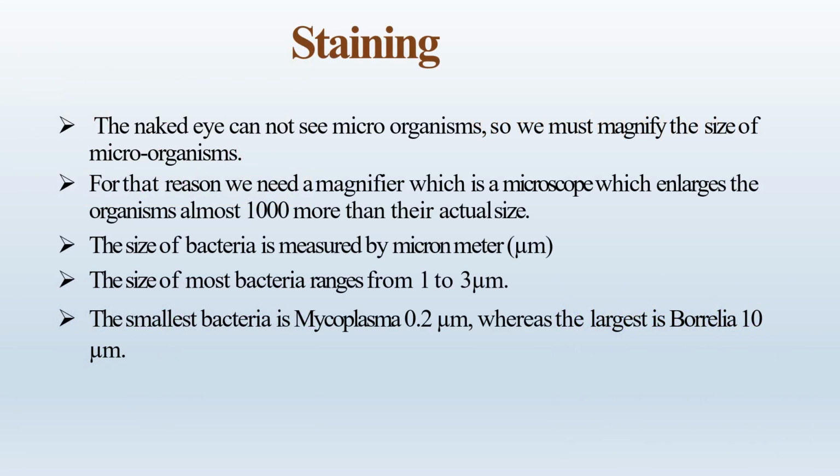As we all know, the human eye cannot see microorganisms, due to which we need to magnify their size to see them. For that purpose we need a magnifier, called a microscope, which enlarges these microorganisms to 1,000 times their original size.